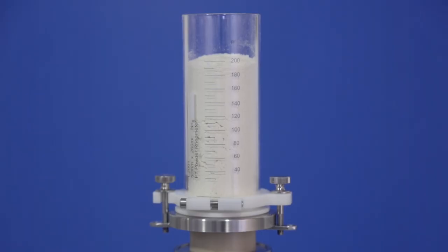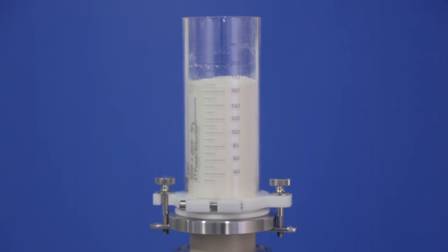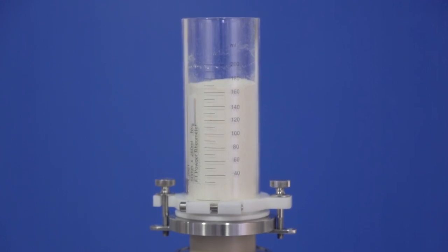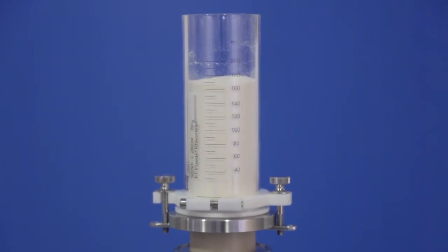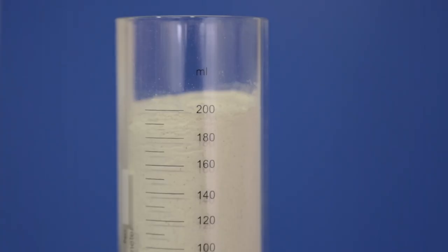Here we can see the sample put on a tapping device to subject it to some compaction, and just a few taps transforms the way the powder behaves. Its density change might be in the order of 10, 20, or 30 percent, but in terms of its flow property changes it now might be five times to ten times less likely to flow.